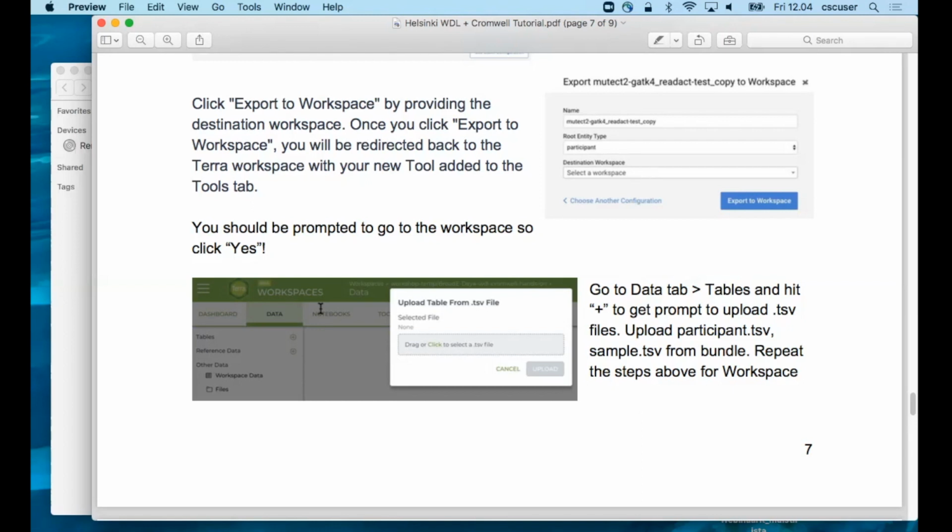And click on the right, upload TSV. Workspace attributes, and open. So cancel, workspace, upload TSV, workspace attributes. Workspace attribute, last one, open. That's all for now. Were you able to do it?